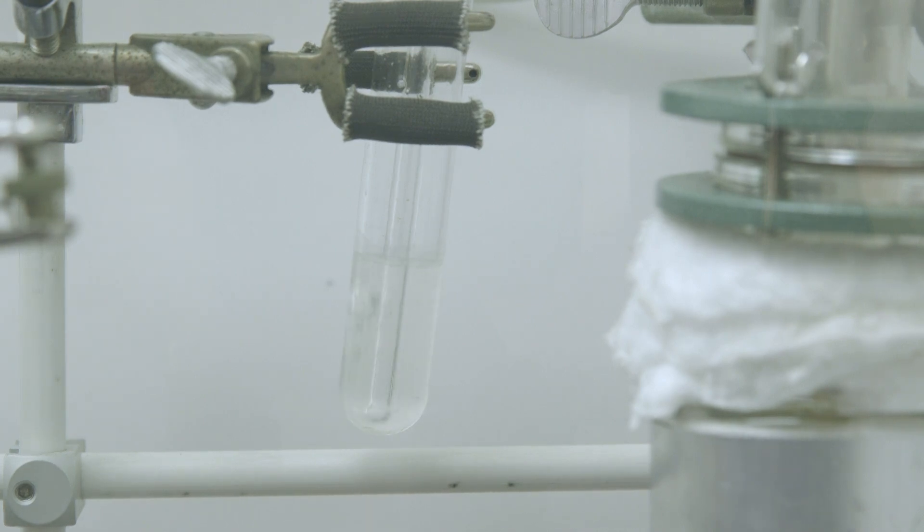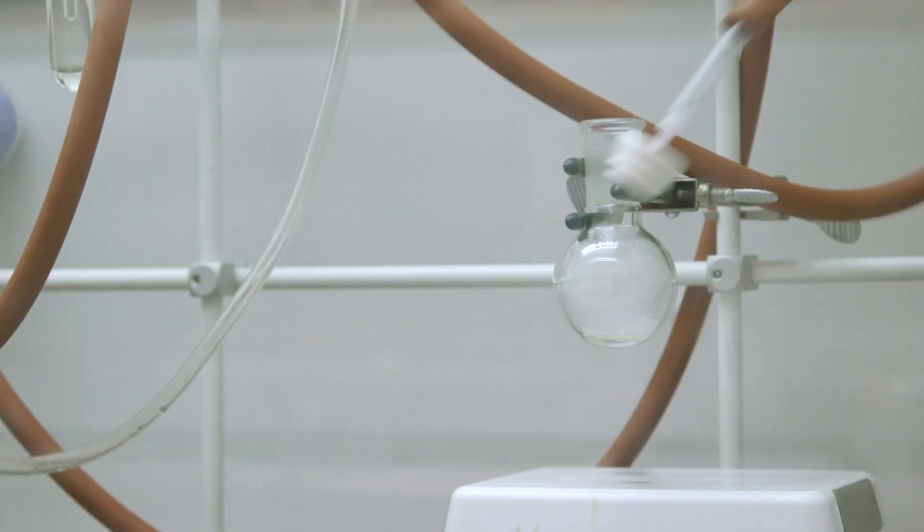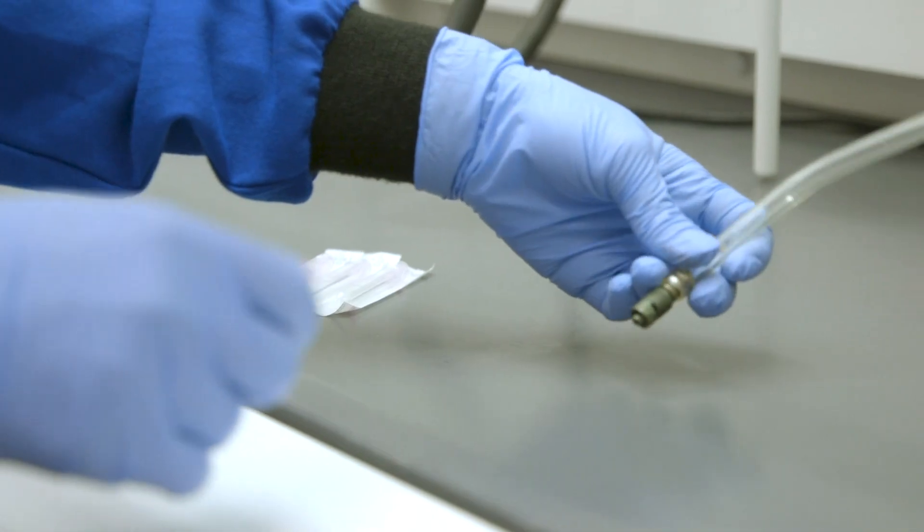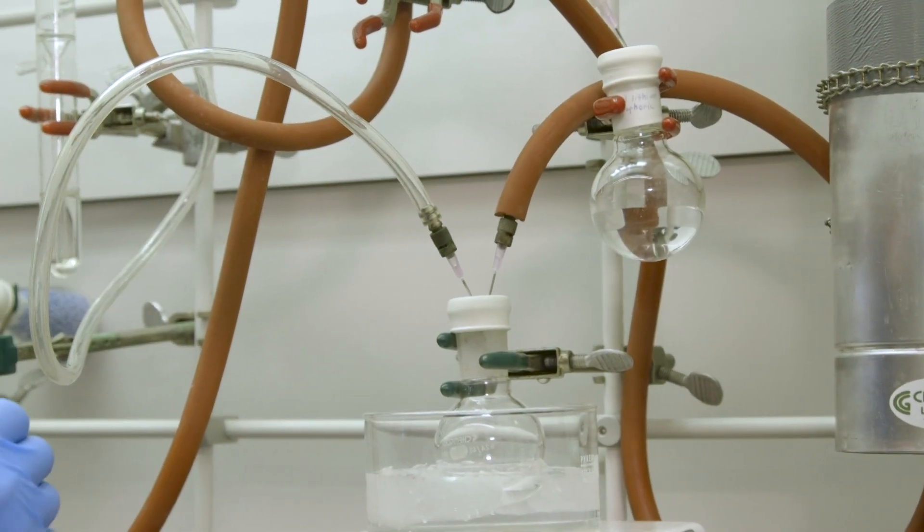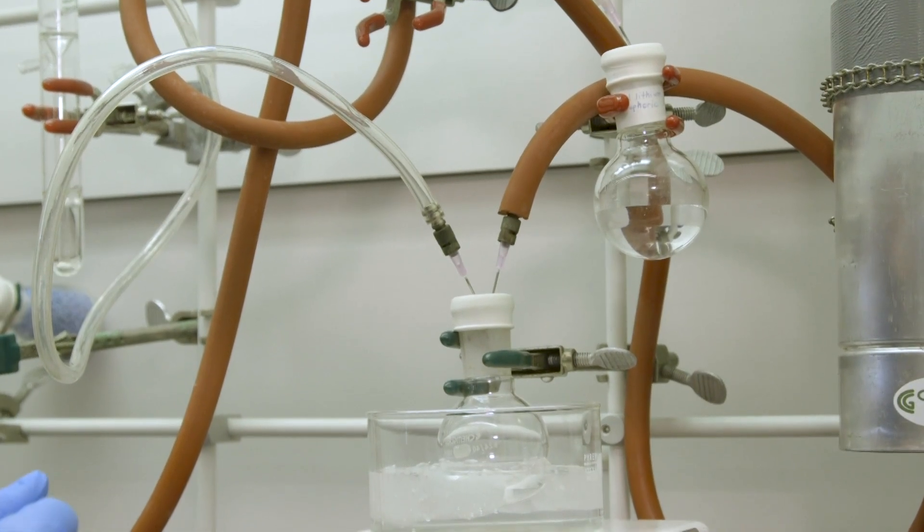If too low, there is a risk of getting oil in the line and if too high, the pressure can pop open parts of the apparatus. An exit bubbler line equipped with a needle must be set up to allow for the flushing of reagent vessels and other containers that are not hooked up to the vacuum.